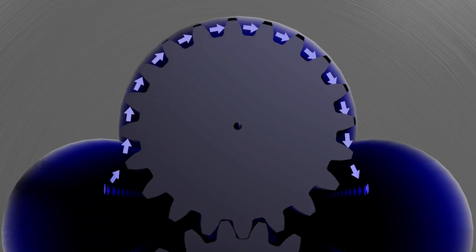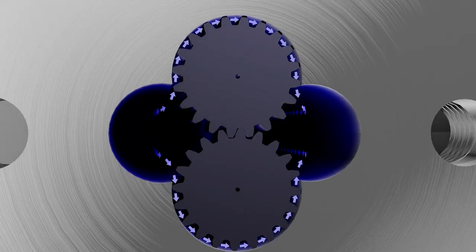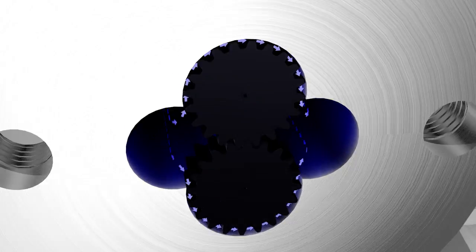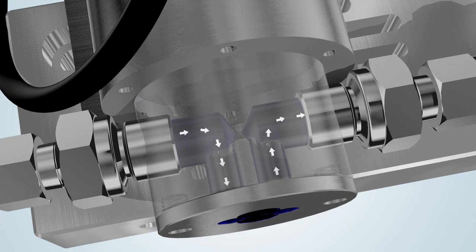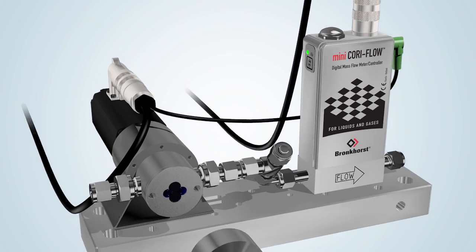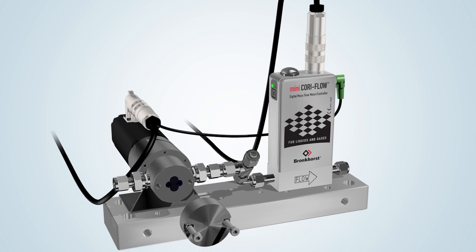The advantage of a gear pump is that it has considerable range. Moreover, these pumps have a low pulse generating capacity, and their maintenance, if required, is relatively simple. The gear pump makes it possible to raise the pressure and induce liquid to flow through the flow meter.